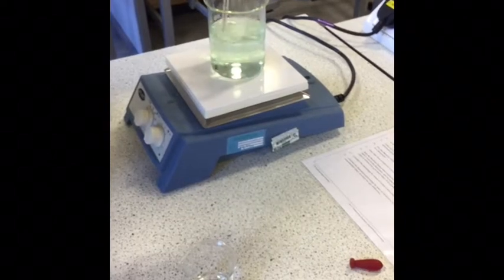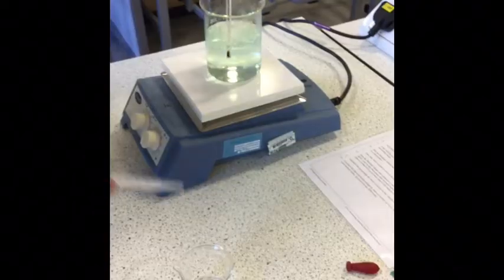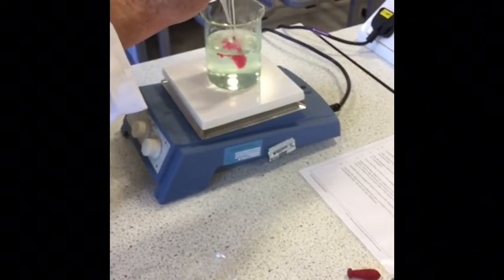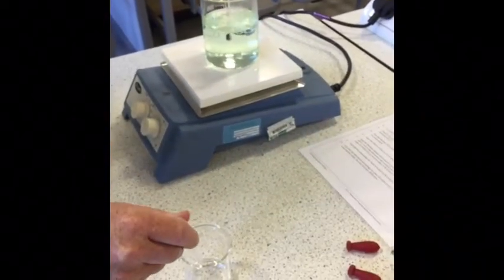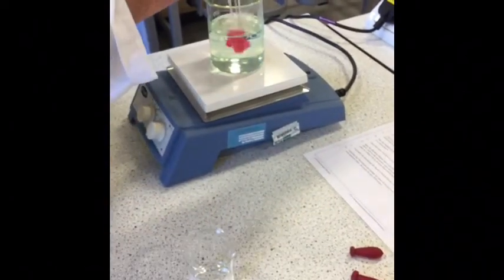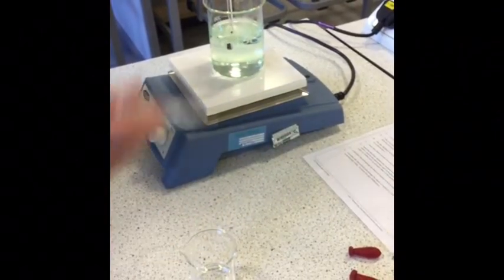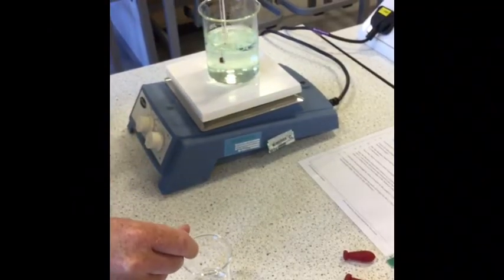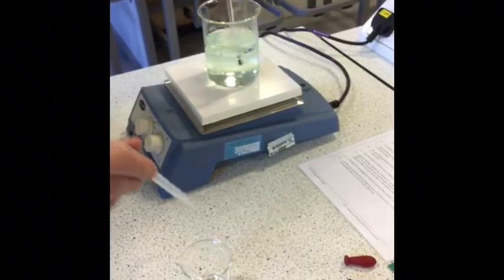That's the colour of the nickel dimethylglyoximate complex we're looking for. Eventually we should get a permanent red precipitate, one that stays.